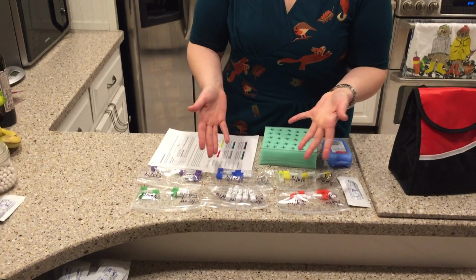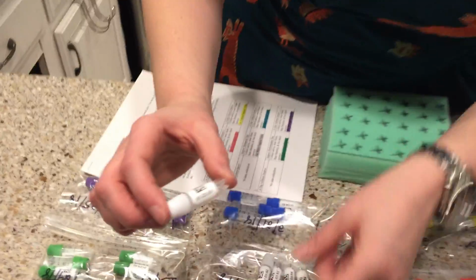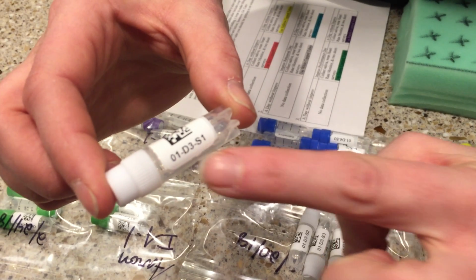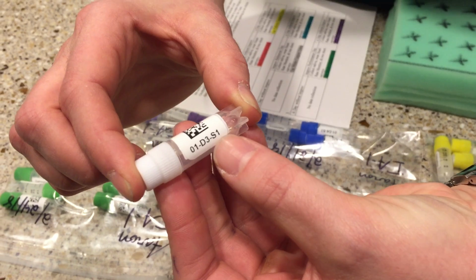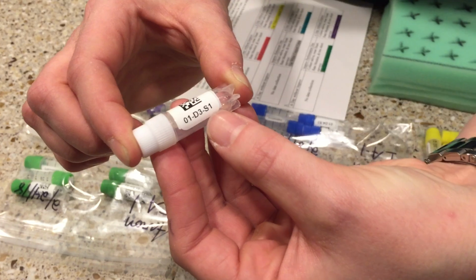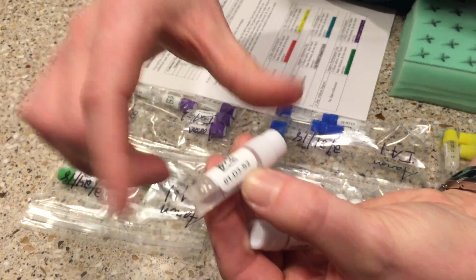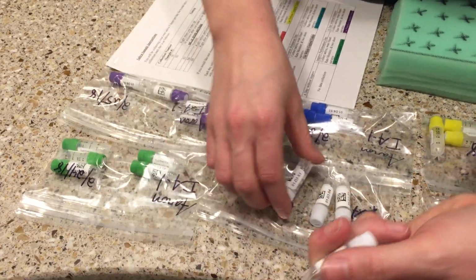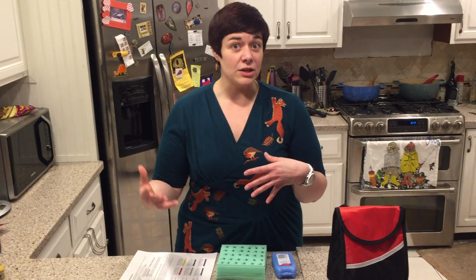So let's, for example, take a look at the white caps. If you come in, you can see that on each of these tubes there's a label. It says 1, D3, S1. You can ignore the first 2 things there. The thing you need to pay attention to is that S1. That stands for sample 1, so the first sample you collect that day. And then you can see this one says S2, we have S3, 4, and 5. I will also text that to you for each sample that you're collecting to remind you which sample number tube you should be spitting into.